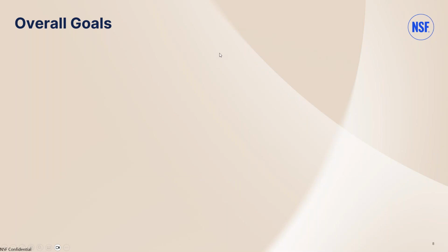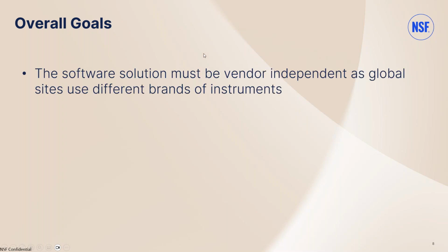So at the time, we decided to start looking into ways we could automate some of these processes using software, and we developed some goals. First being that we wanted it to be vendor independent. We're a global company, we have labs across the world, and we use different instruments, different software. We needed something that could provide the same evaluations no matter where it was being used.